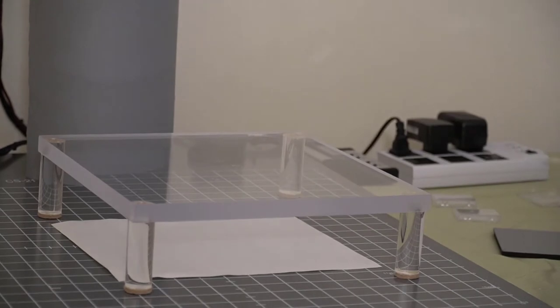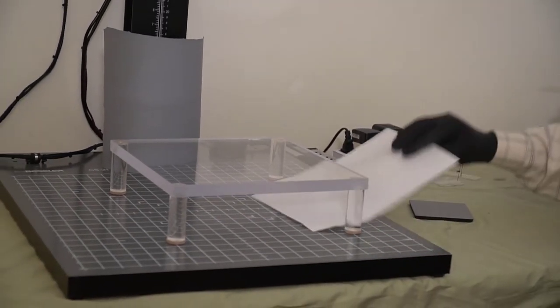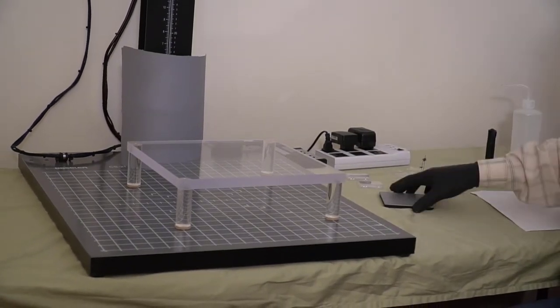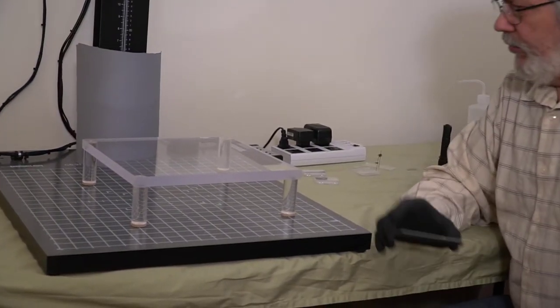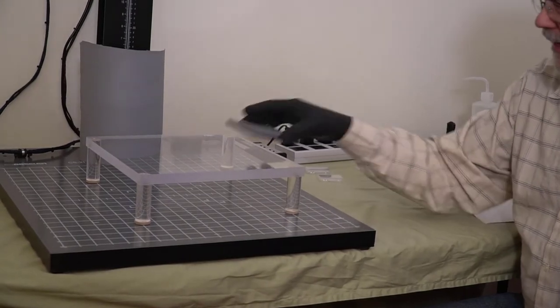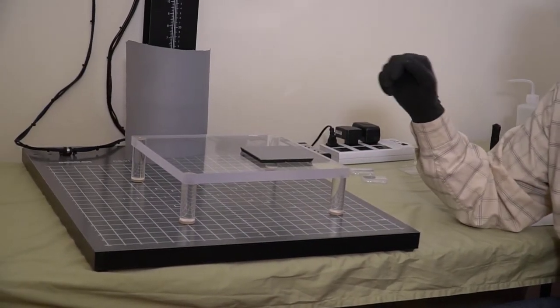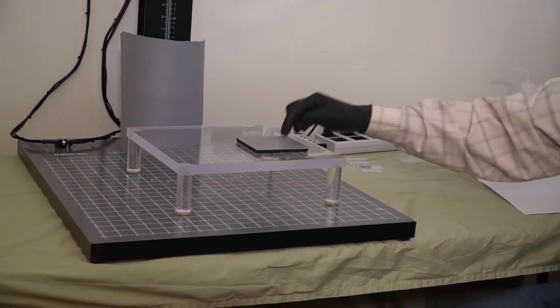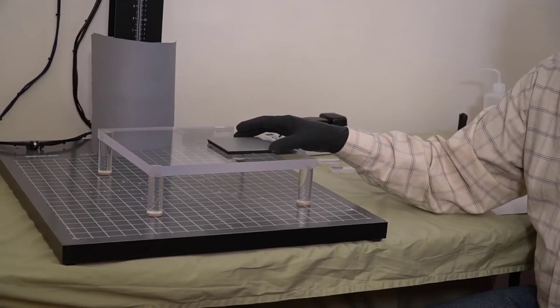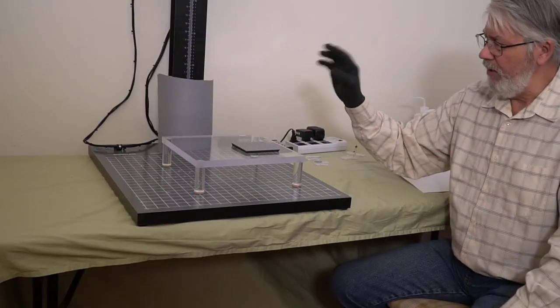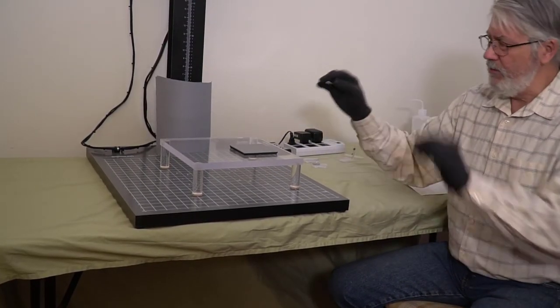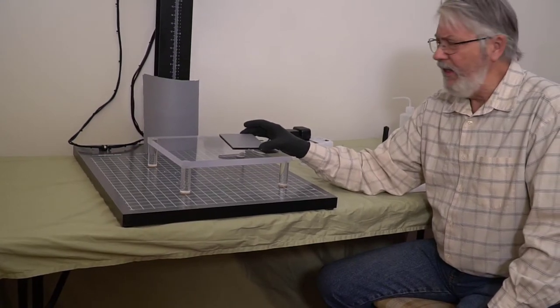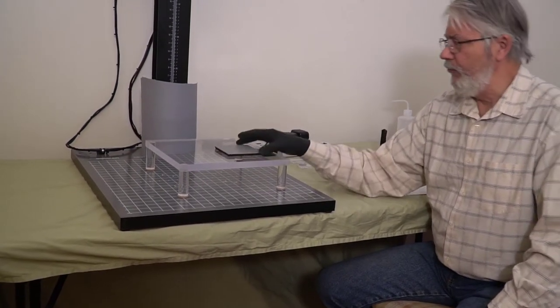It's a really versatile thing. You can put any color paper underneath it without disturbing the specimen. What we have found over the years of shooting is that the most accurate background is a neutral gray, because in a variety of specimens, neutral gray is not something that naturally occurs on any specimen in nature. So you can knock out your background without taking parts of the insect off.